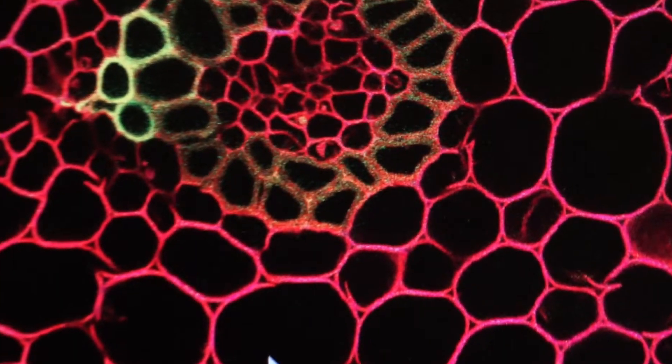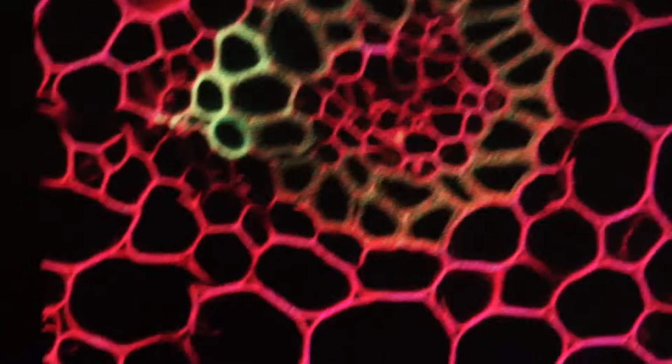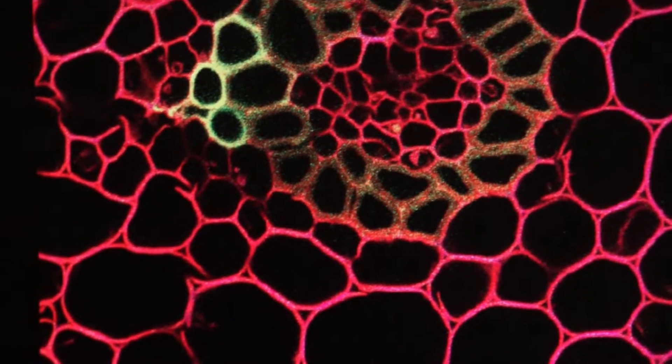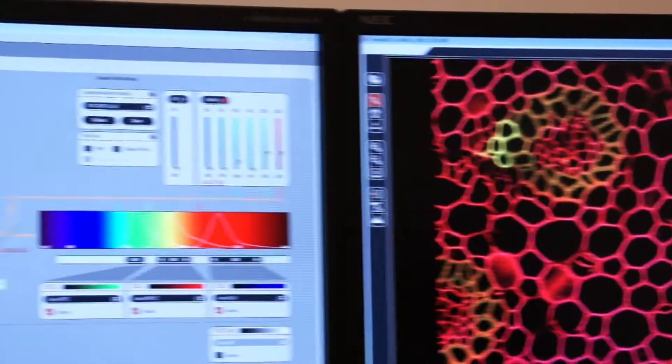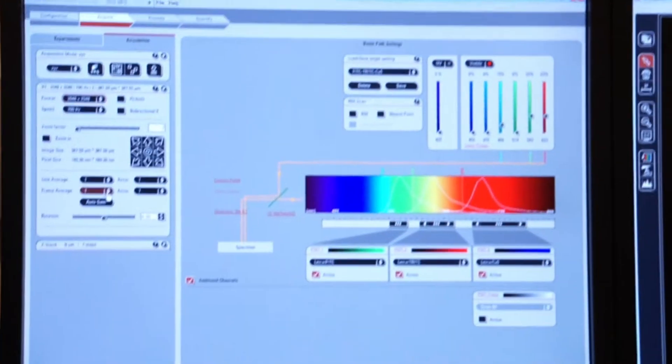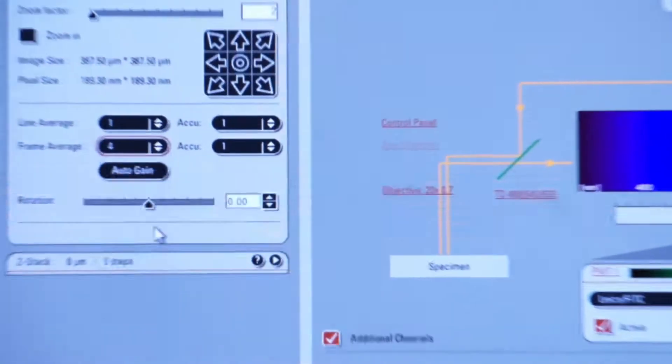So speed is helpful when you do averaging, but there's always a trade off on whatever you select in terms of making your better image. Let's go back and turn off line averaging. We'll make that one. And let's do frame averaging again. We'll do four.